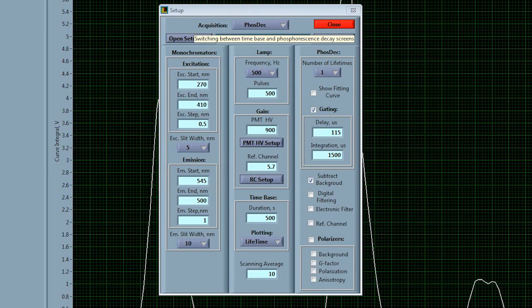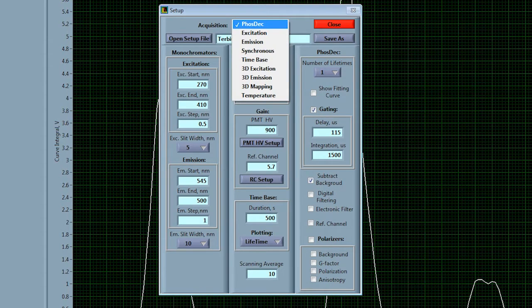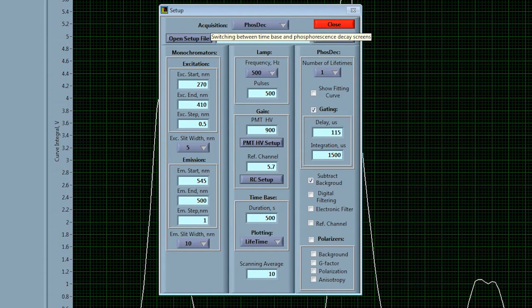In this case we want to actually acquire a phosphorescence decay which has been selected and we're going to excite at 270 nanometers and we're going to collect emission at 554. We've set the lamp frequency to run at 500 Hertz and in this case we've asked it to collect a decay that results from 500 flashes of that xenon lamp.